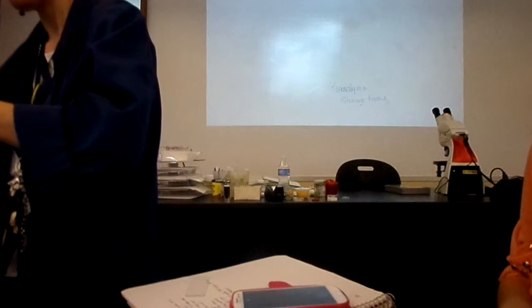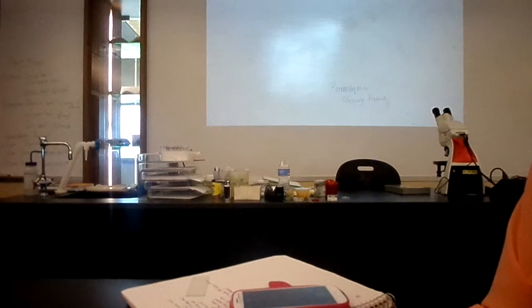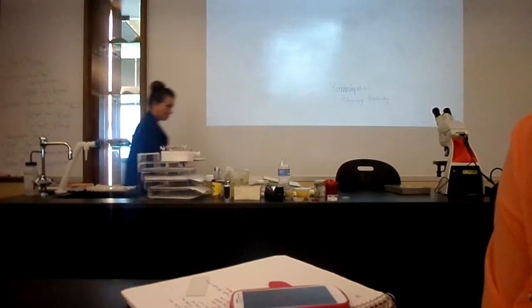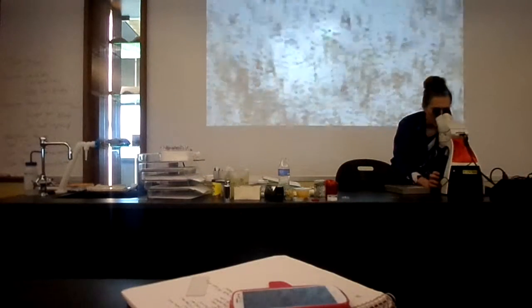Susanna, can I have your iodine? Yeah. And then, banana smushes really easy. So just give it a good smush. There you go. Thank you.